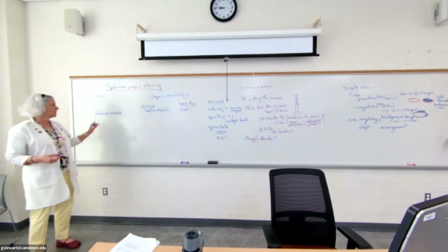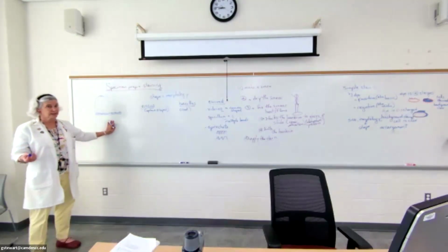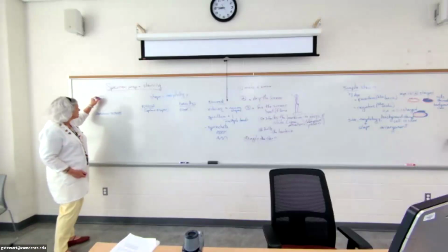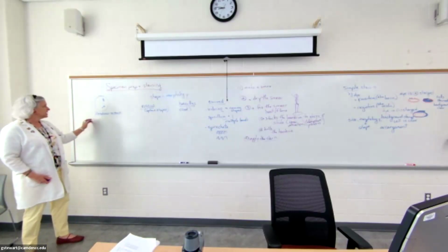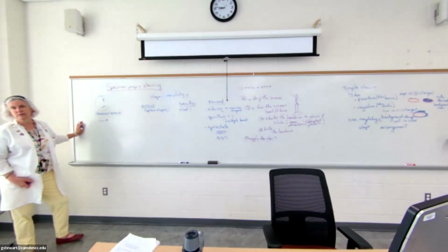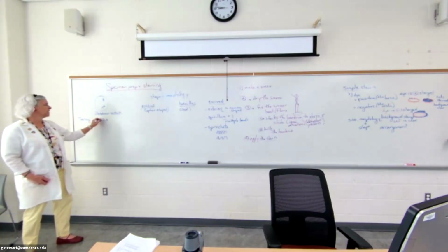I can't, so I'm going to write it like this with underlining 2 words. Remember, we talked about in lecture last time, that's how we name things, genus, species. And you've made some sort of a drawing in here, something like this, maybe. Beautiful. And then under here, there's a line that says X for total magnification. That's going to be 1000.